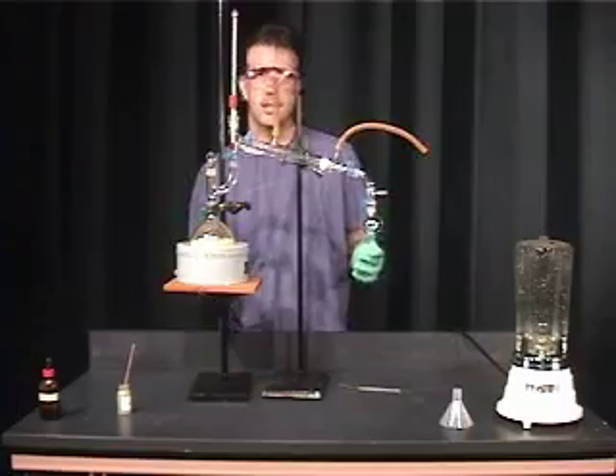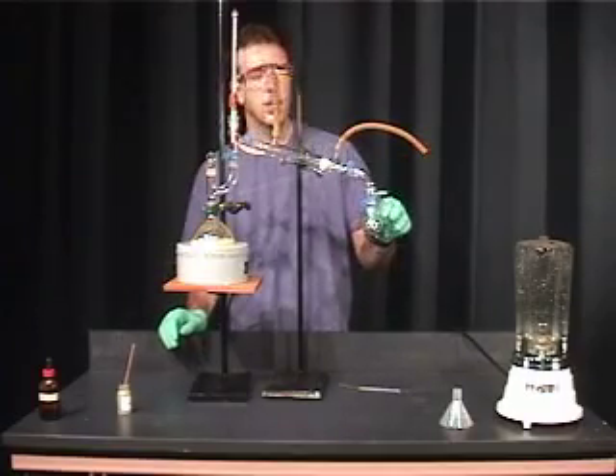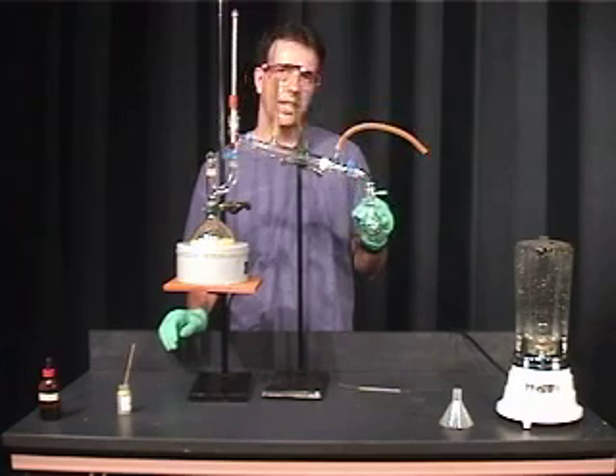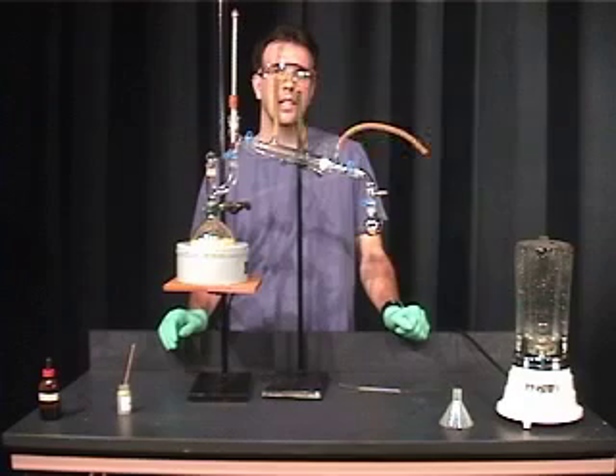Once the distillation is complete, you want to let this cool down. Then you're going to use organic extraction — specifically extraction using dichloromethane — to isolate your limonene.